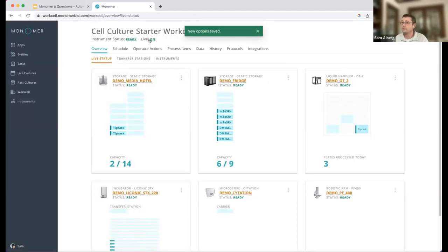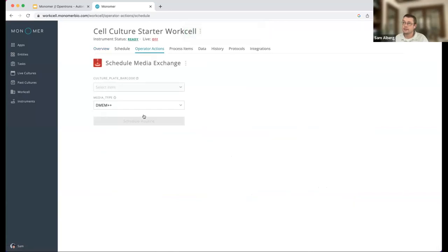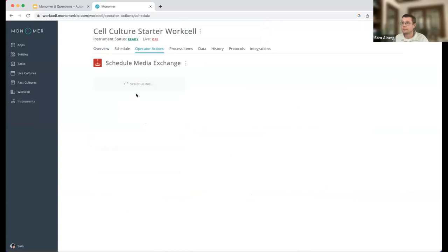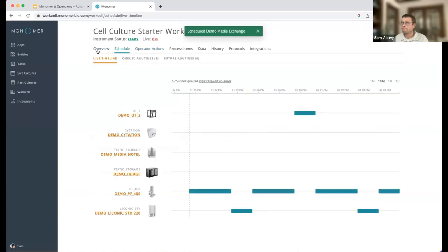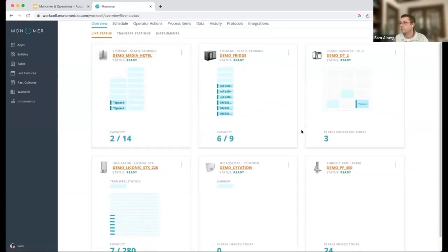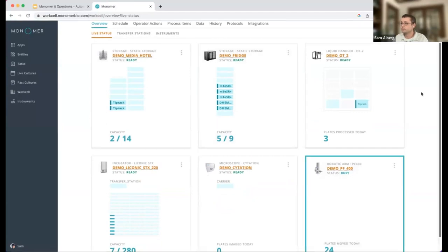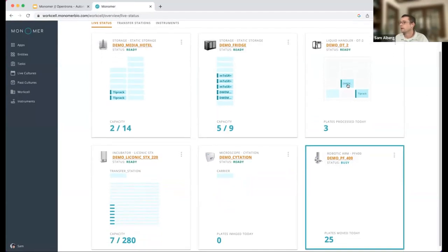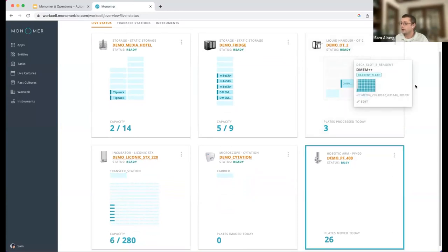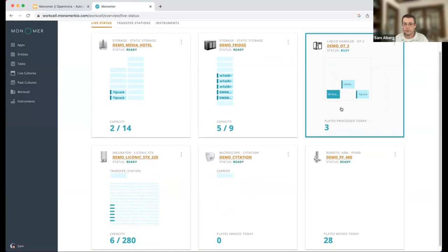And we'll do that one more time. So again, I would schedule a media exchange by selecting the plate, my media type, and scheduling that routine. Once it's set live, you can view the progress of that from this screen. So now our media plate is on deck on the Opentrons. Here comes our culture plate. We're now performing the media addition, and we'll move it back to the incubator.